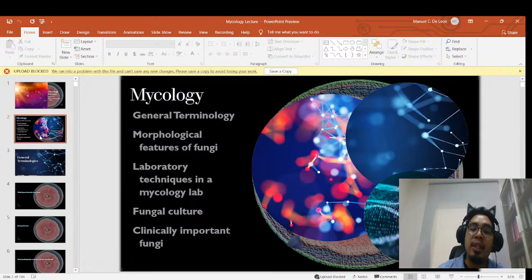Okay, so these are the things that we're going to talk about: general terminology in mycology that we need to follow, morphological features of fungi, laboratory techniques in the mycology lab, and I'll show you a couple of.